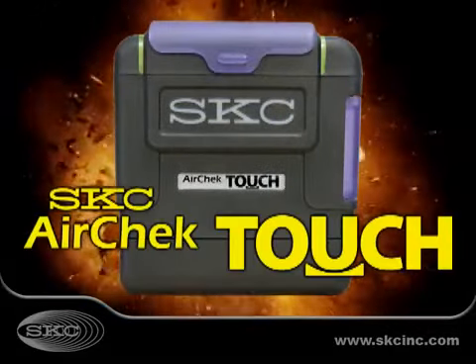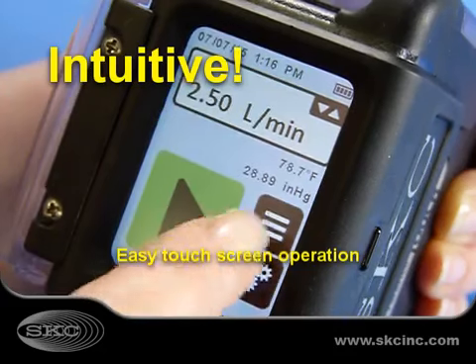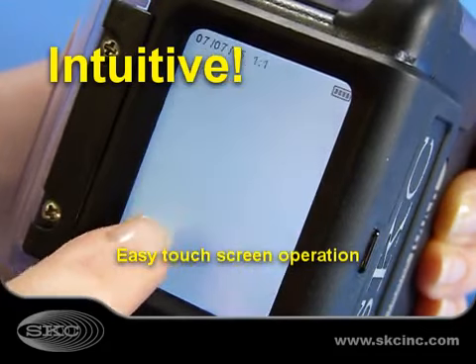Introducing the SKC AirCheck Touch Sample Pump, the ultimate in sample pump innovation. With its highly intuitive color touch screen, you don't even need an operation manual.